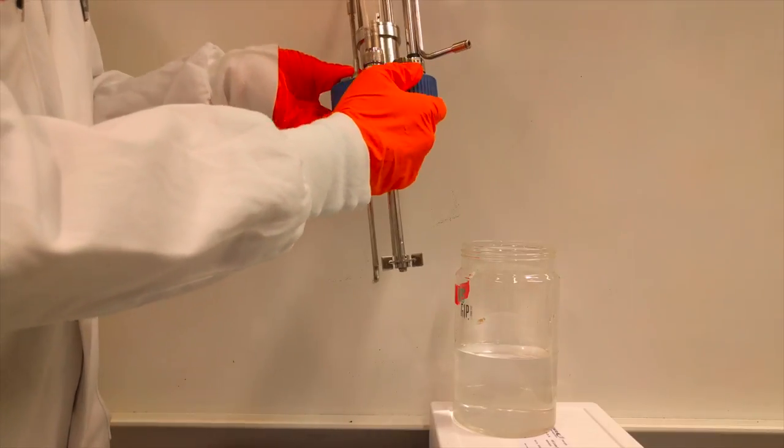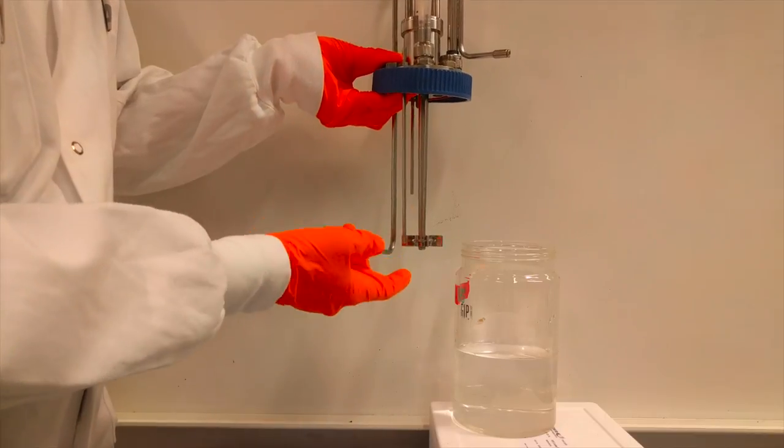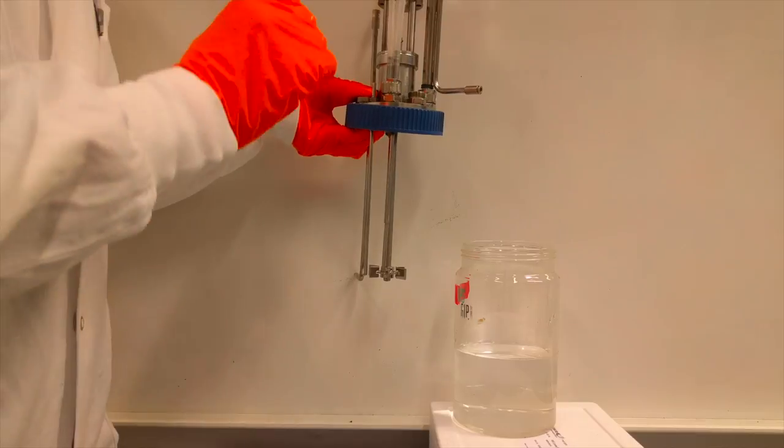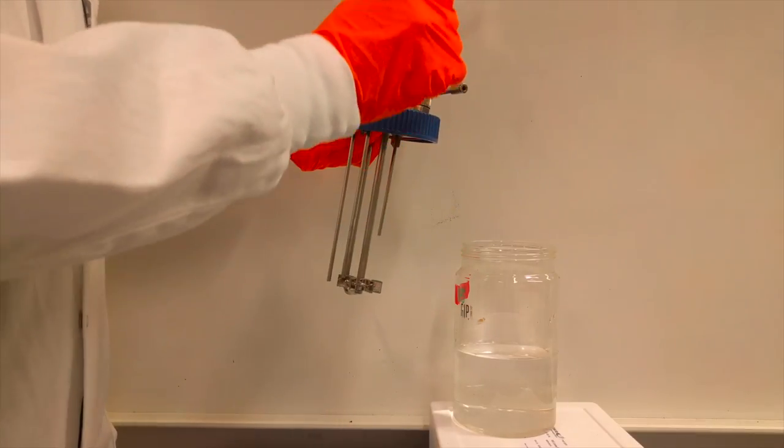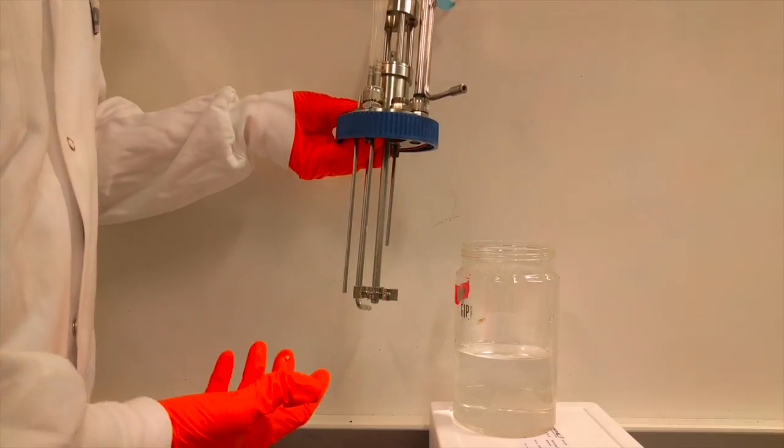You're also going to see another port here. This is just a thermometer port. We're going to use a computer and a digital thermometer to measure the temperature throughout the reaction to make sure that we keep the heating at a very precise temperature. So we're going to control heat, aeration, and stirring, all via our computer.